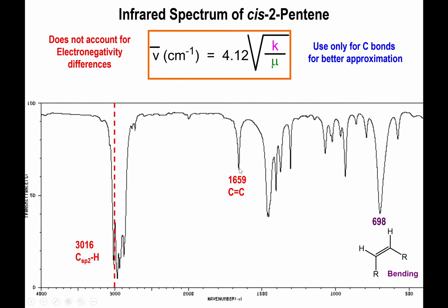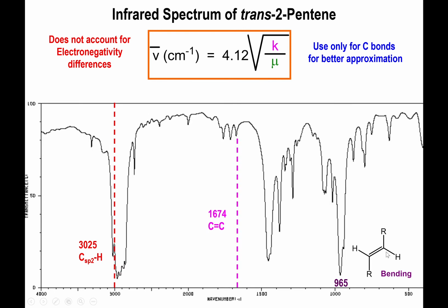It's not as strong as your geminal or even your terminal alkene that had 3 hydrogens, right? So now the intensity here is decreasing, but you still have that peak above 3000, right? Not by a lot, but it is above 3000, 3016 to be exact, representing the fact that you still have carbon-hydrogen bonds involving sp2 hybridized carbons.